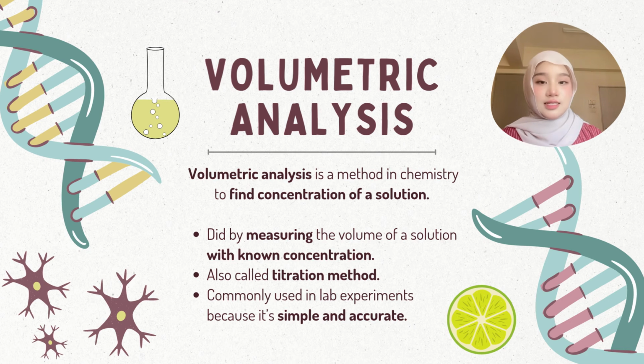What is volumetric analysis? Volumetric analysis is a method used in chemistry to find the concentration of a solution. This method is also known as titration. It is commonly used in the lab because it is simple, fast, and also accurate.